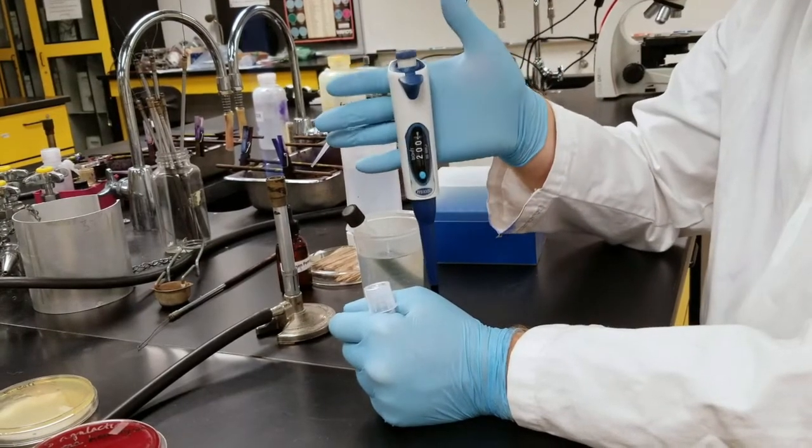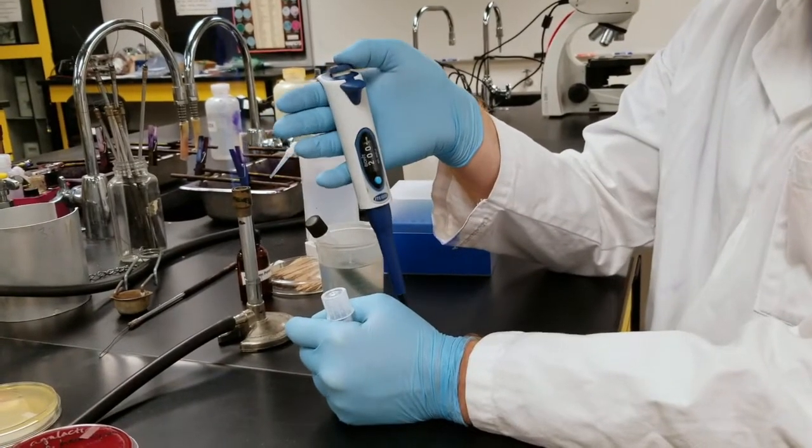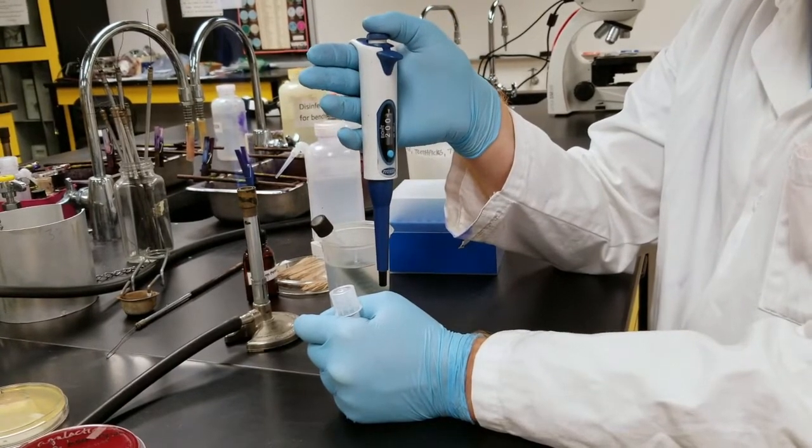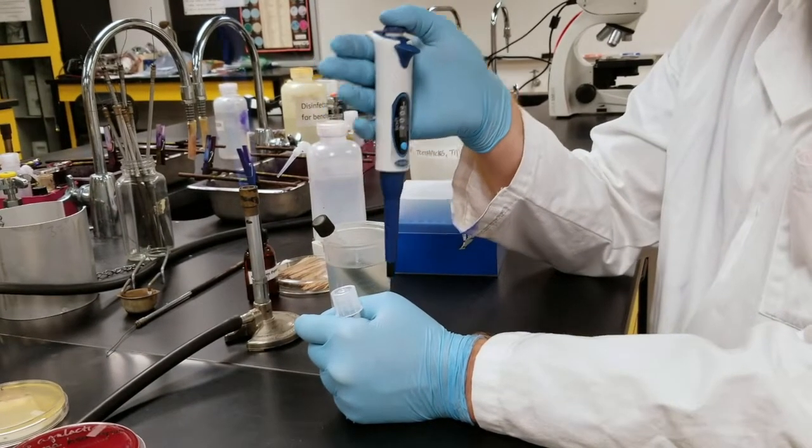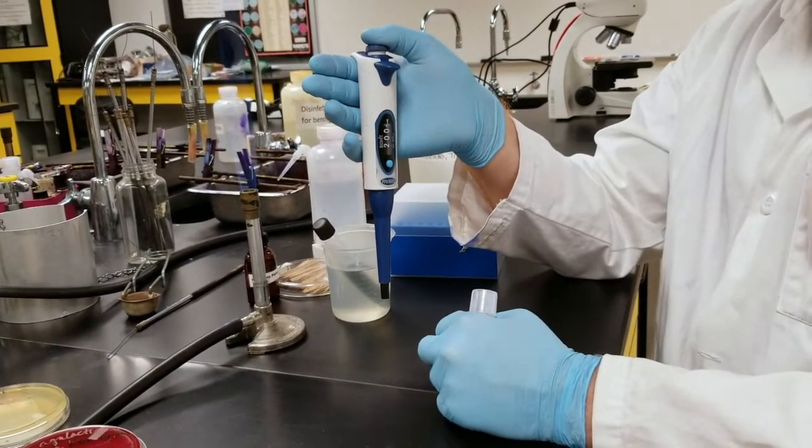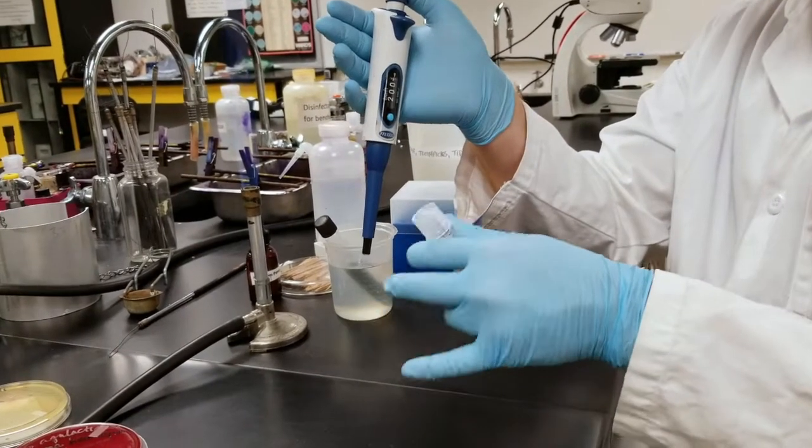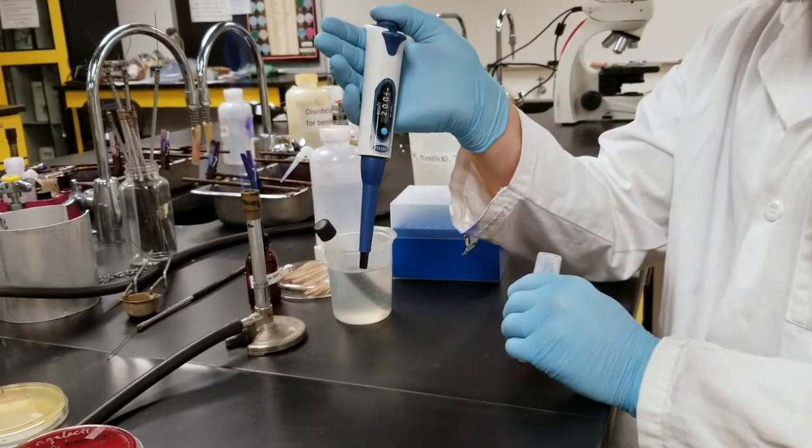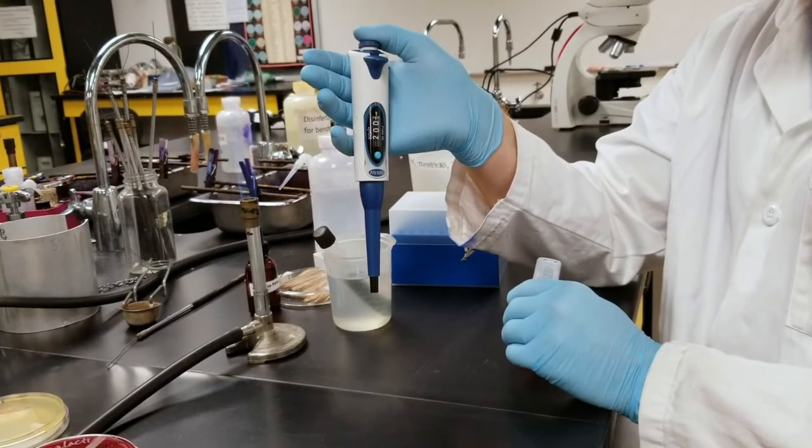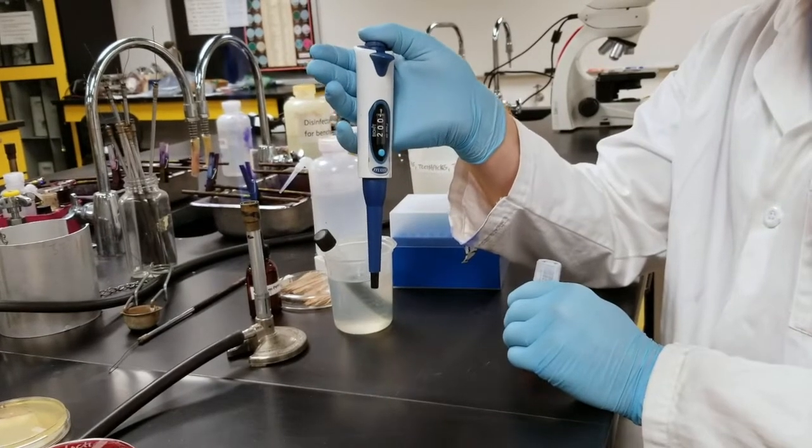When using a pipette, it's very important that when you go down, push down on the top knob to push out air and you have a first stop of resistance. That is where you are set to withdraw to 200. I would withdraw into my tip and then when I'm transferring the contents of my tip, I would push down even more. This second stop here evacuates all the solution in your tip.